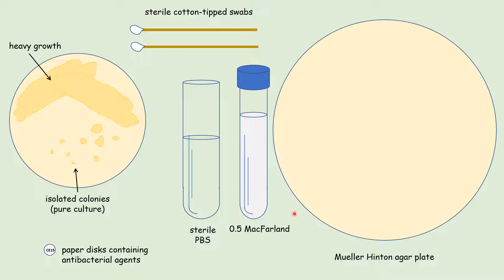The last reagents we'll need are a Mueller-Hinton agar plate — which is considerably larger than a standard petri dish — and a series of paper discs that each contain different antibacterial agents.